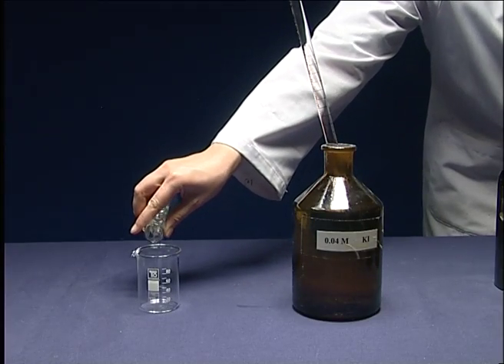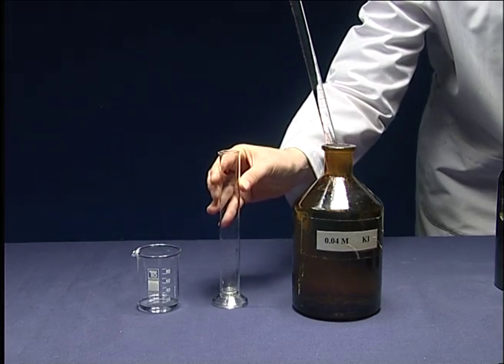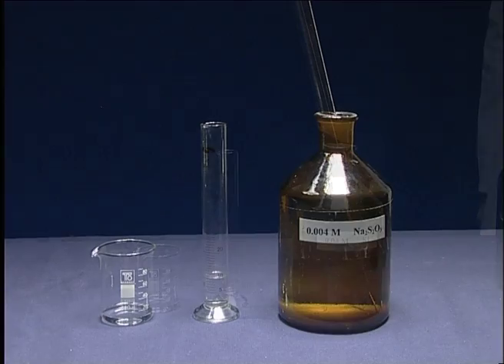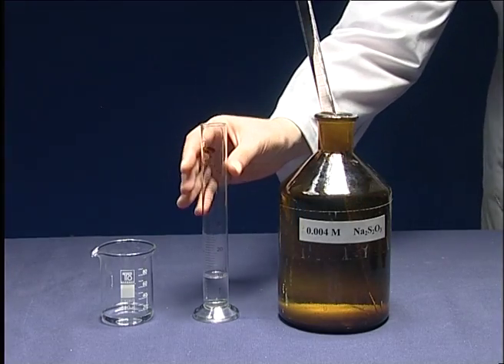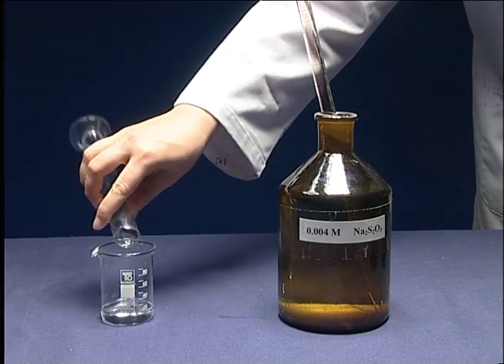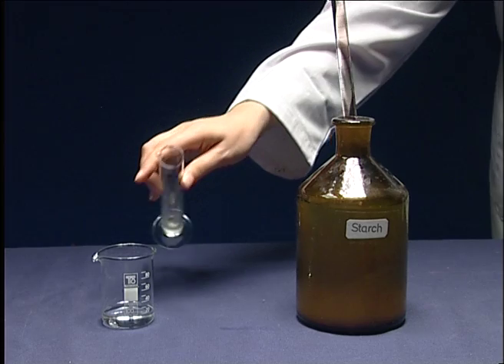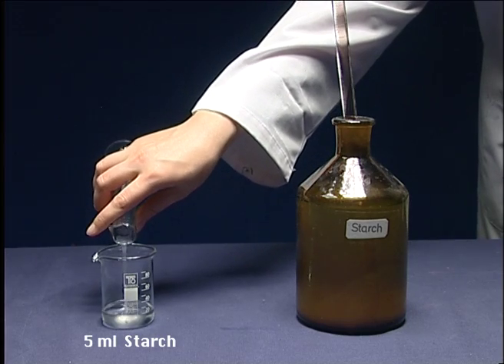Put 10 milliliters of potassium iodide in another 100 milliliters beaker and add 10 milliliters of sodium thiosulfate. Add 5 milliliters of starch solution.